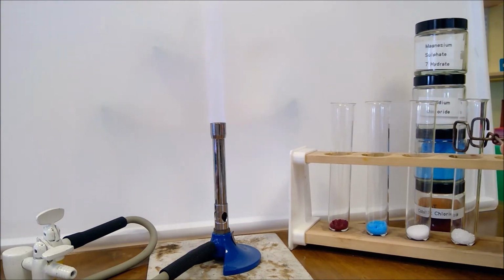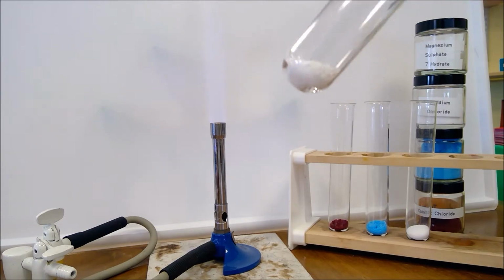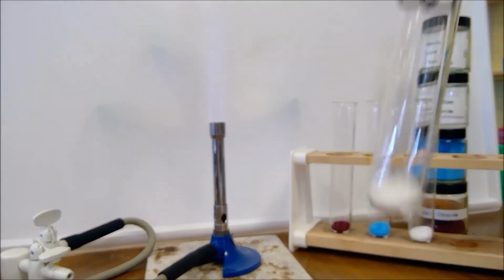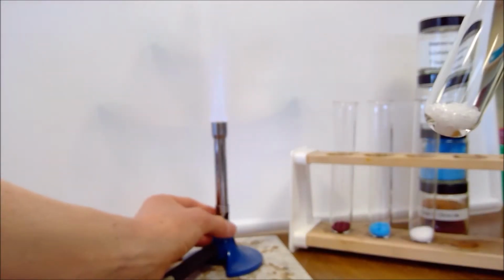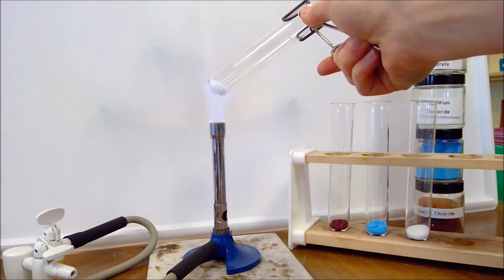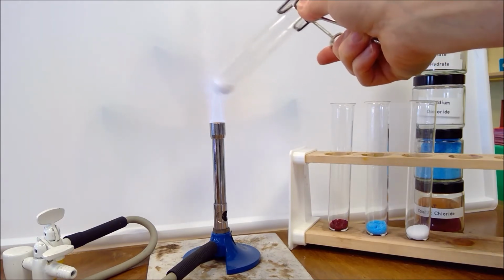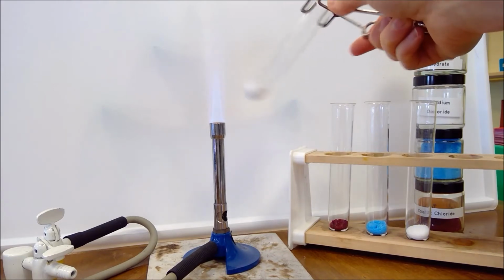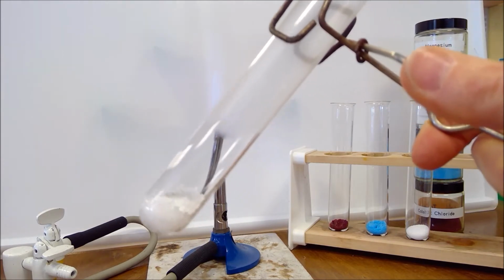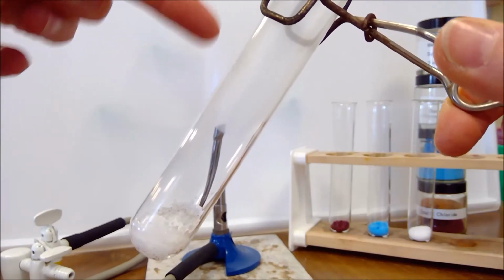So our first sample is magnesium sulfate. So we need to write down what our magnesium sulfate looks like in the first place. And then we are going to heat this. So observe carefully. So can we see all the way up the tube here? We have condensation.